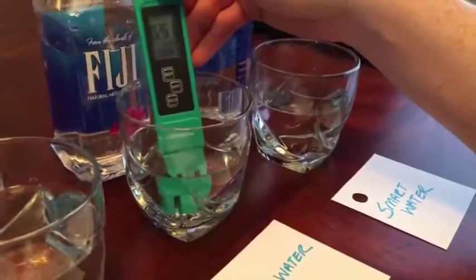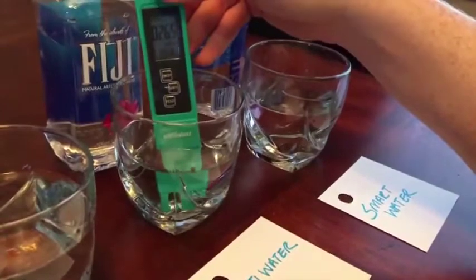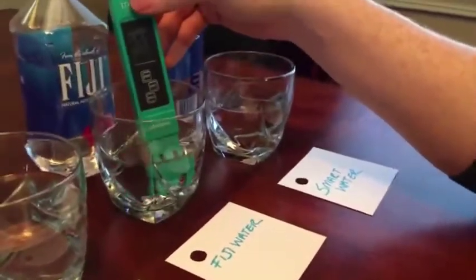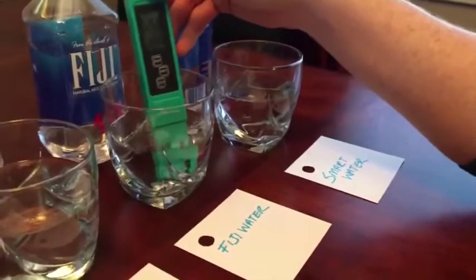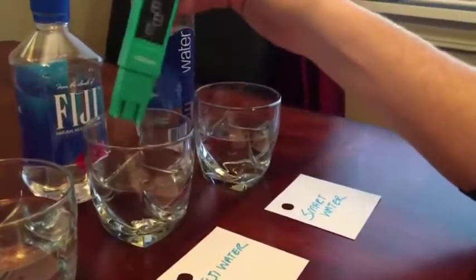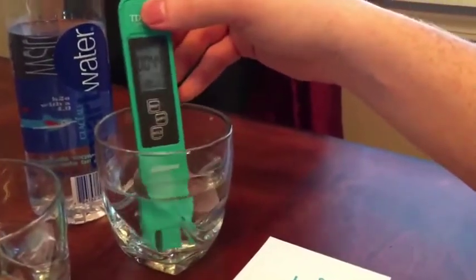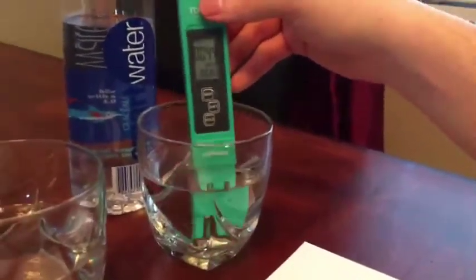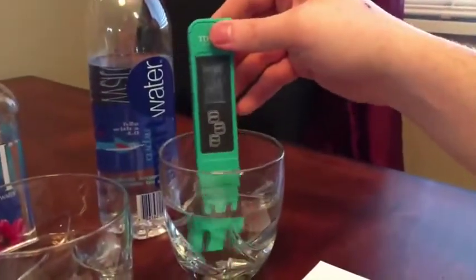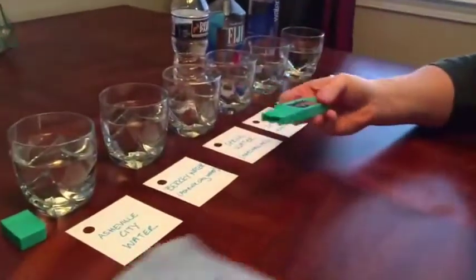Fiji water measures 263 µs/cm — so we definitely have quite a bit of not only dissolved solids but also a high salt and metal content. Finally, Smart Water measures 44 µs/cm. This is a really good tool and it helps us see exactly what is in our water.